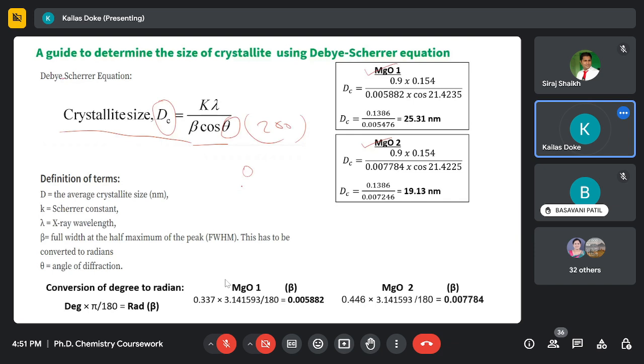So similarly, we can calculate the A values from all the D values. D values we can get from the diffraction pattern, and we can also find out the volumes of the unit cell. So this is a published paper, and we analyzed the X-ray diffraction of magnesium oxide crystal. We analyzed a few parameters. Is that clear? Yes, sir. Okay, last five minutes.